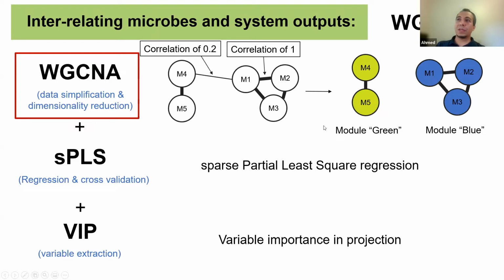What you want to do next is to identify the clusters or modules on your network. It is really easy to identify here, and it becomes, of course, more sophisticated as the scale of the data set increases. So here it's just like, okay, we can basically identify 2 modules, module 1 here, which we're going to call the blue module, and the other module, which has only 2 taxa here, and we're going to call it the green module. So you identify these modules.